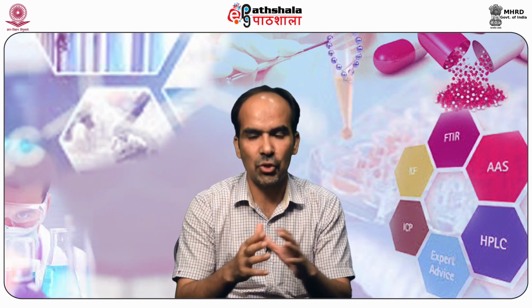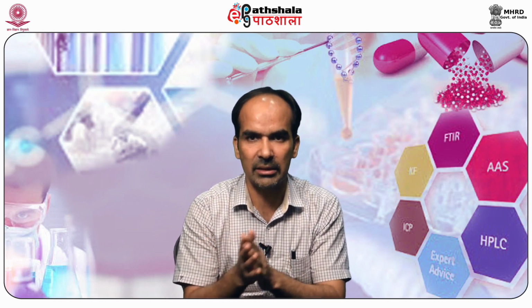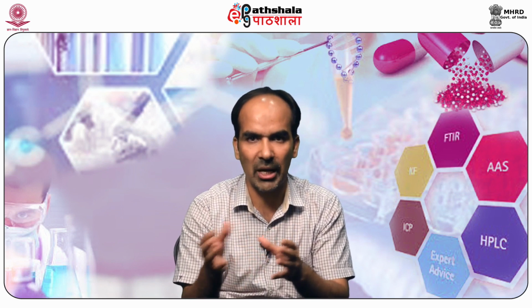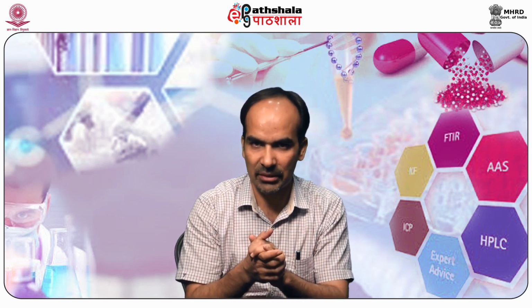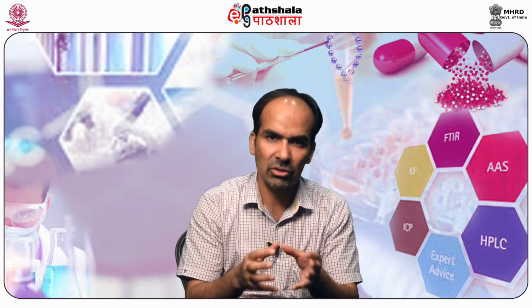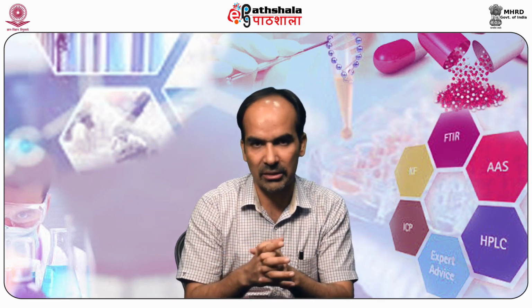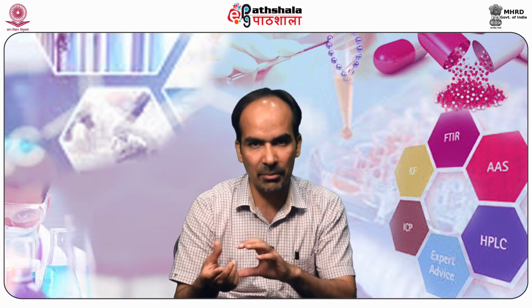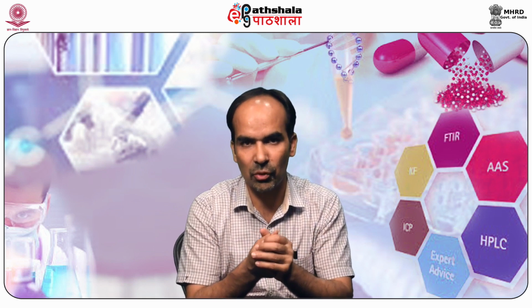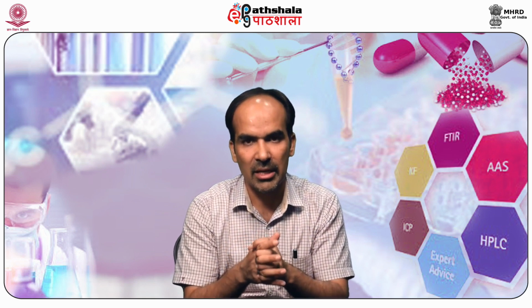So as we have seen in UV spectrophotometric analysis, it is a UV method that works very well once you don't have interfering substances along with the analyte in the matrix. But this is not the situation most often met in natural products. So when you have interfering substances, or when the pure substances are not available, what are you going to do? Visible analysis or colorimetric analysis is the way forward.